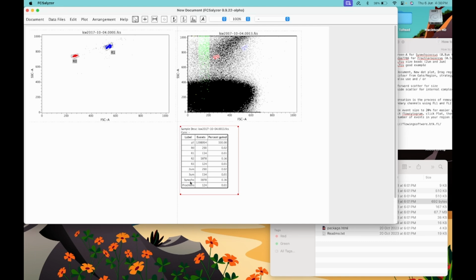And also for Synechococcus, since we are also able to view them under epifluorescence microscope, usually we will calibrate through correlation analysis the counts from both flow cytometry and direct count to see whether we were able to obtain a certain level of precision.